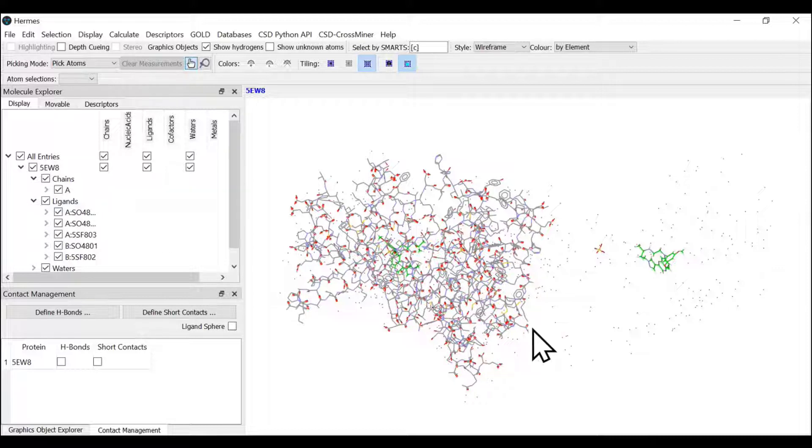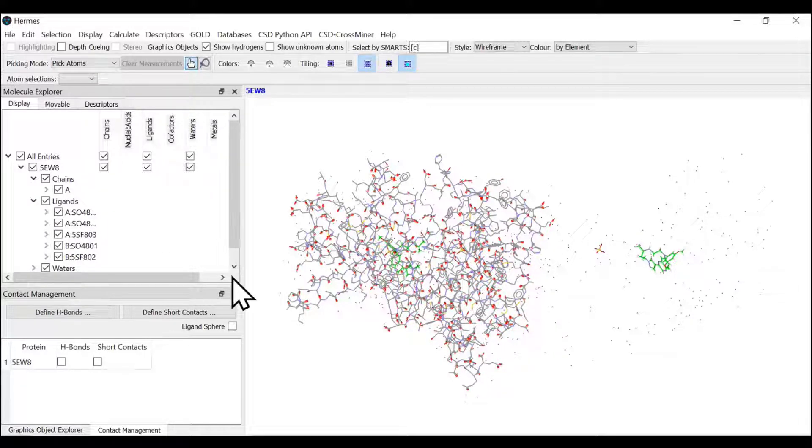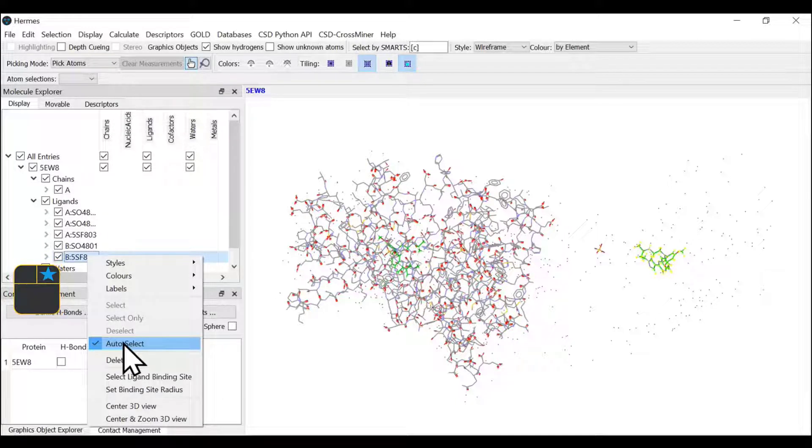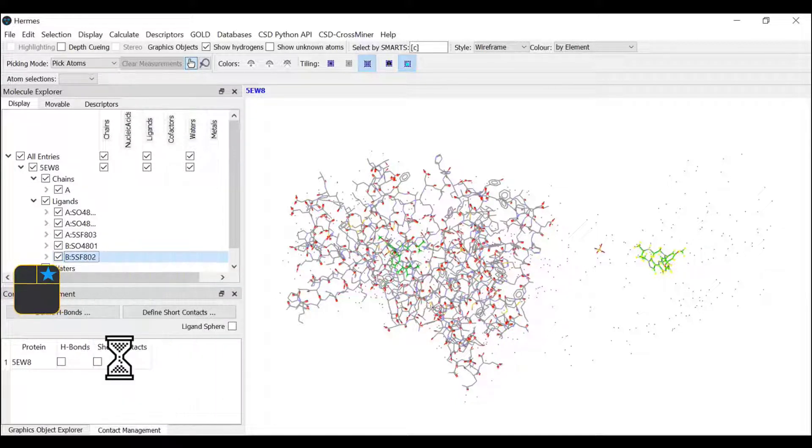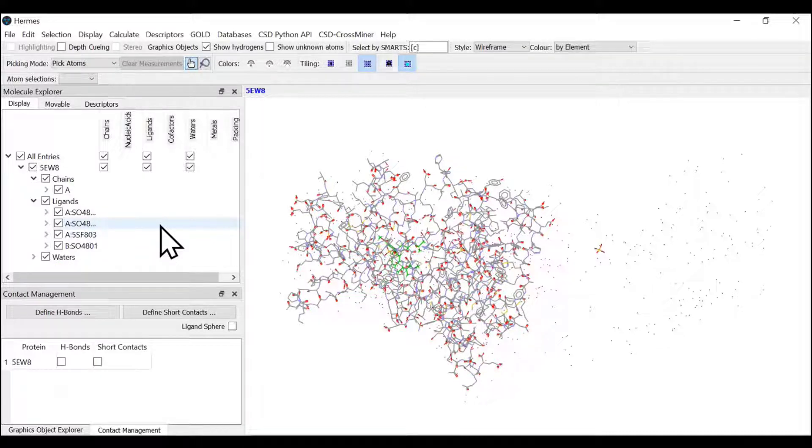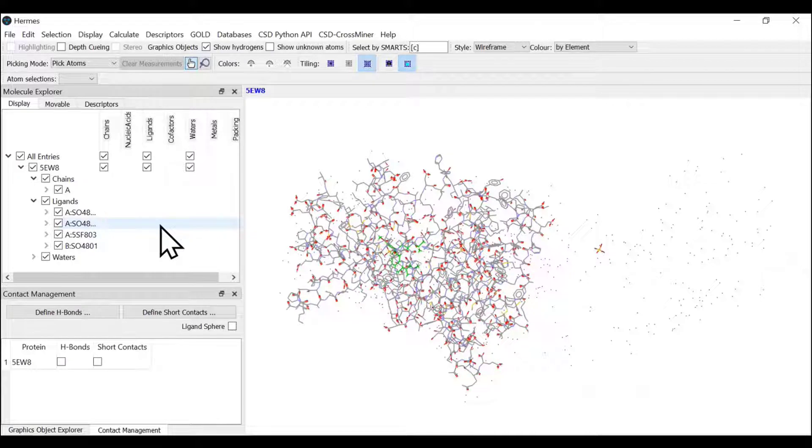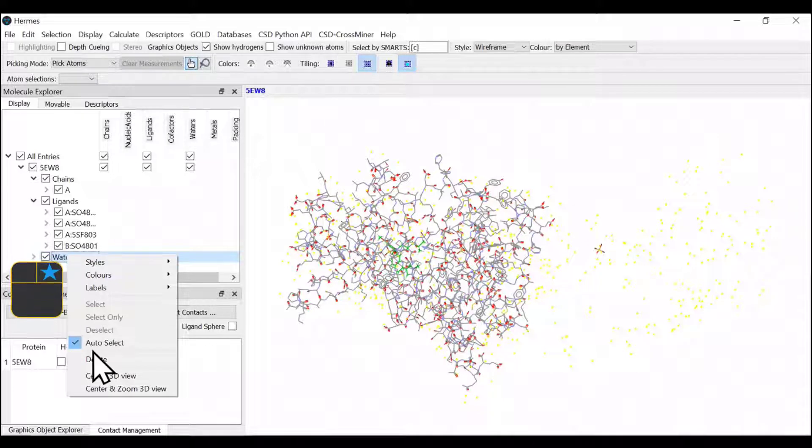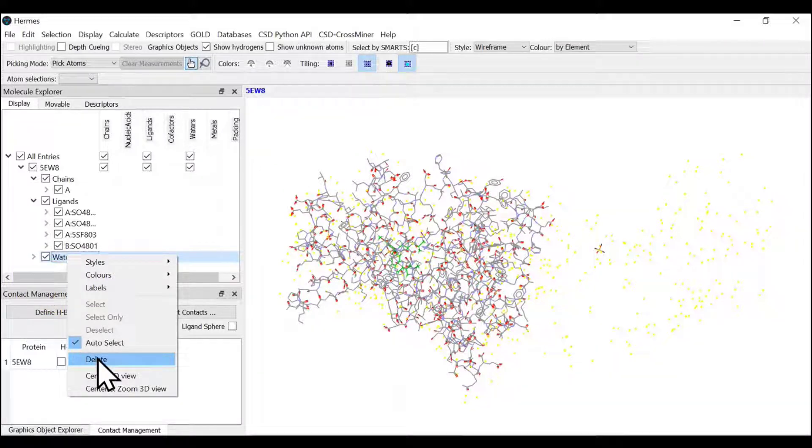We also do not need the associated ligands, so right click, select, and delete. In this example, we're not interested in water molecules since we didn't find any functional water molecules. These are water of crystallization, and we're going to remove them for simplicity.